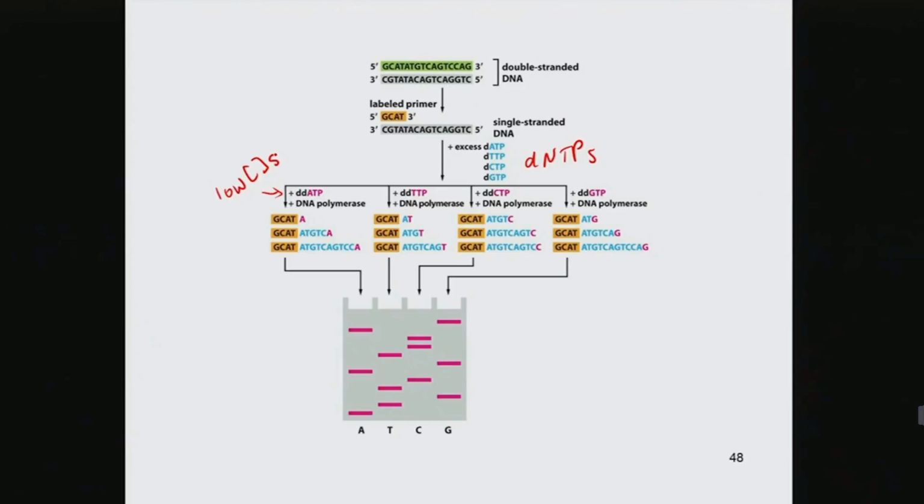Maybe right off the bat, the polymerase incorporates the dideoxynucleotide. So you get shorter and shorter fragments. And then you can run each of those fragments on a gel. Again, it's very specific because you've labeled which ones have those dideoxynucleotides. And again, you can read the sequence going 5' to 3'.